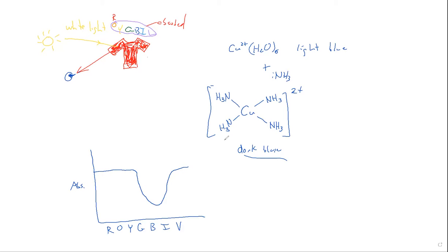And so what we're going to do with this complex, let me show you this idea. If I have my dark blue solution, this is going to be concentrated, this complex dissolved in water, and it's a dark blue solution. And so let's shine the light through there.